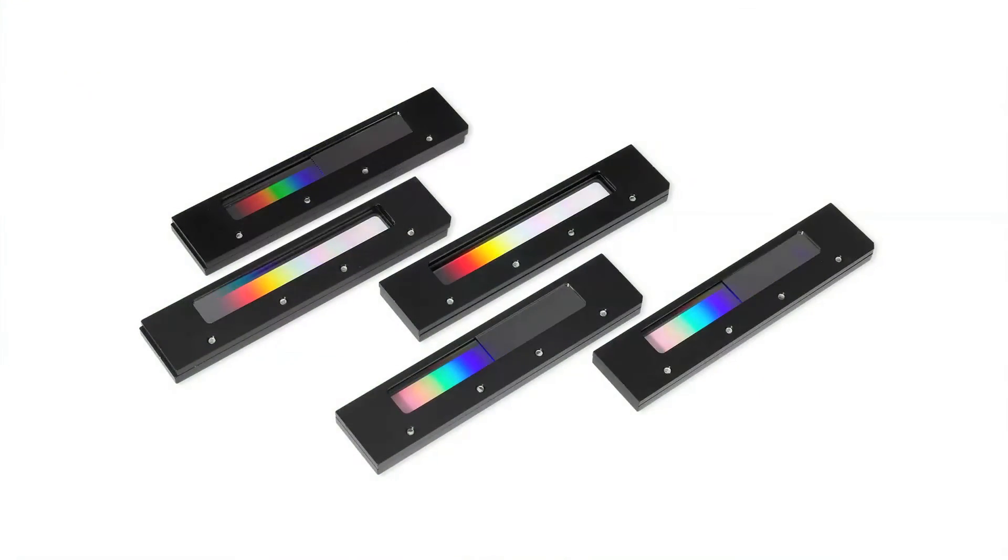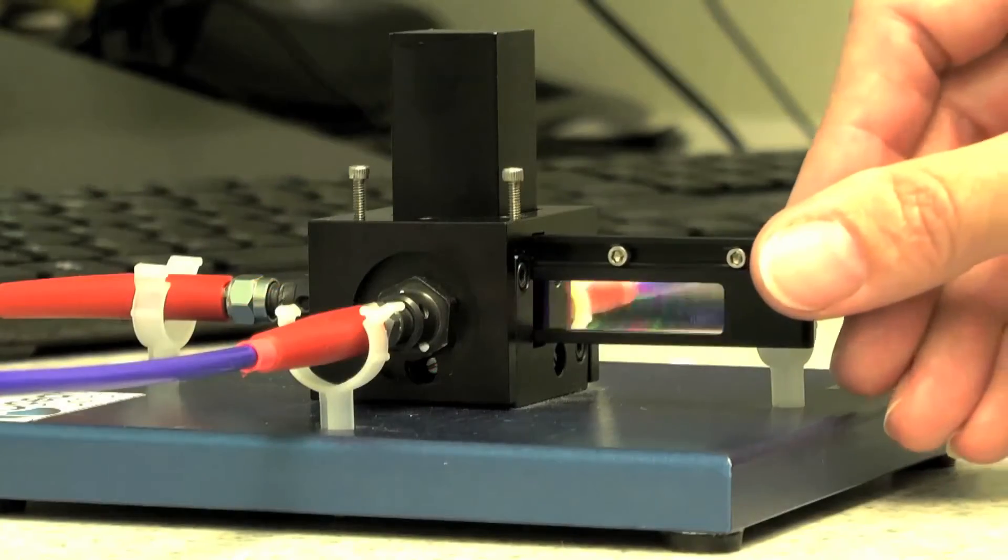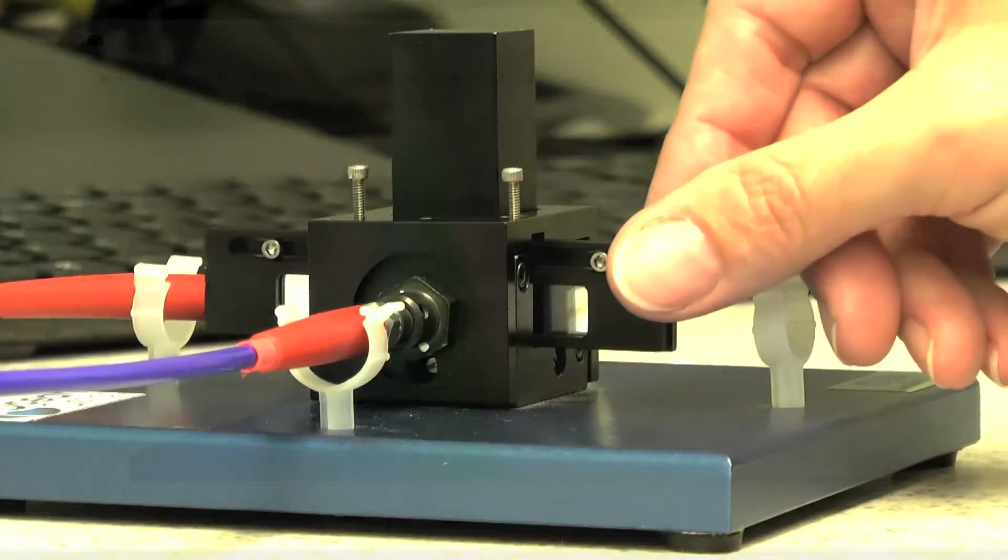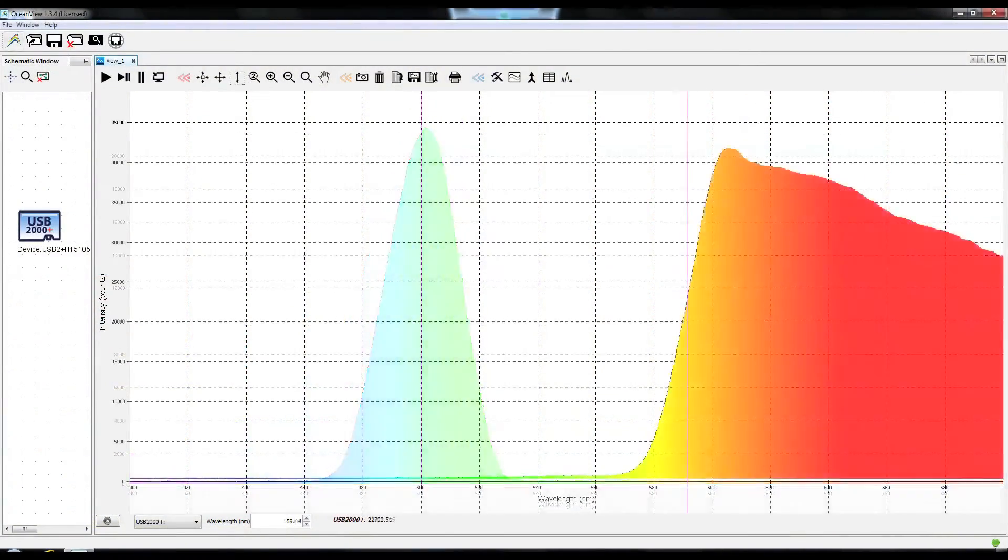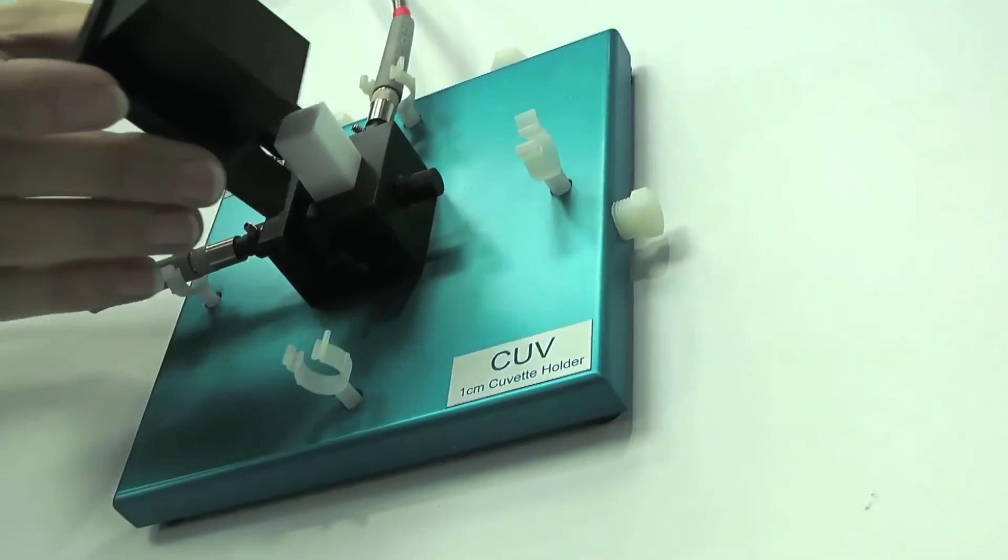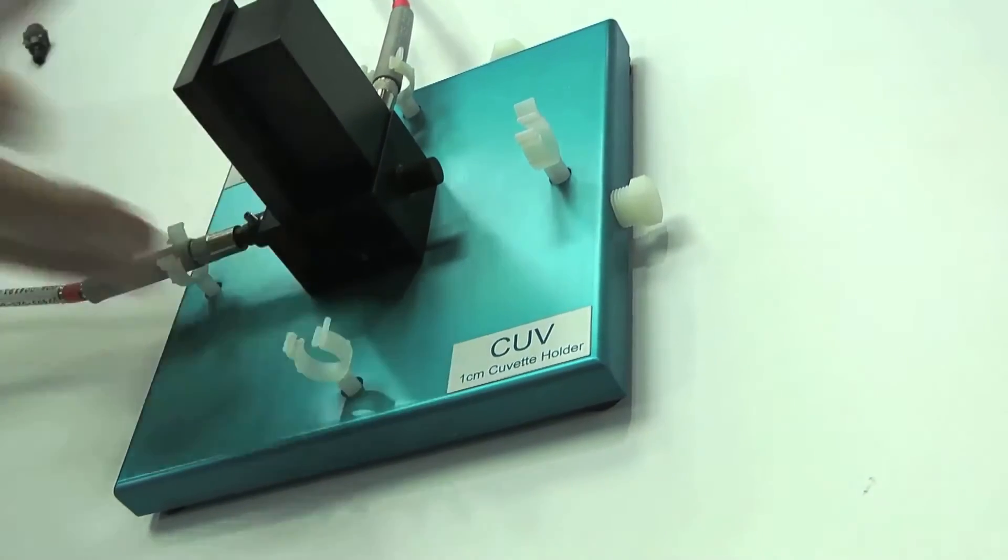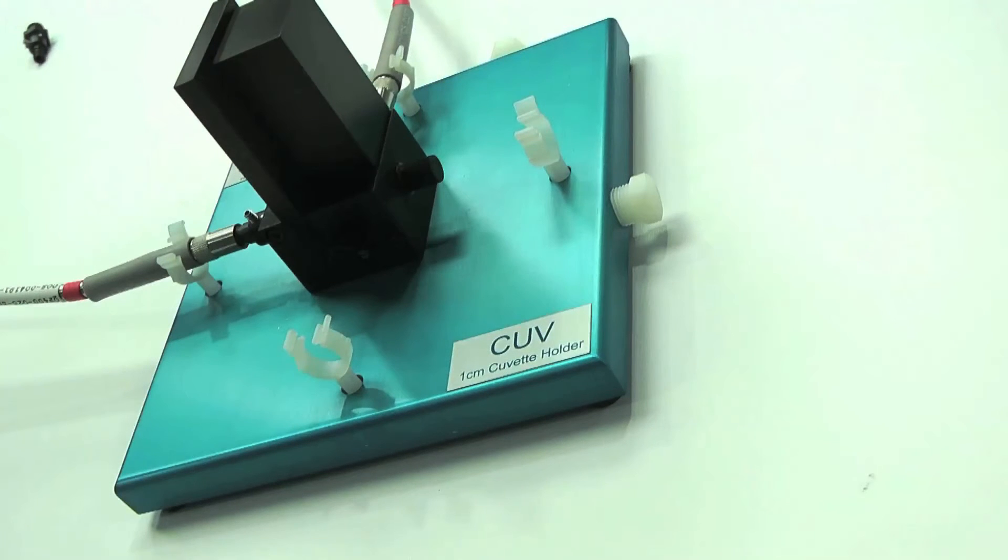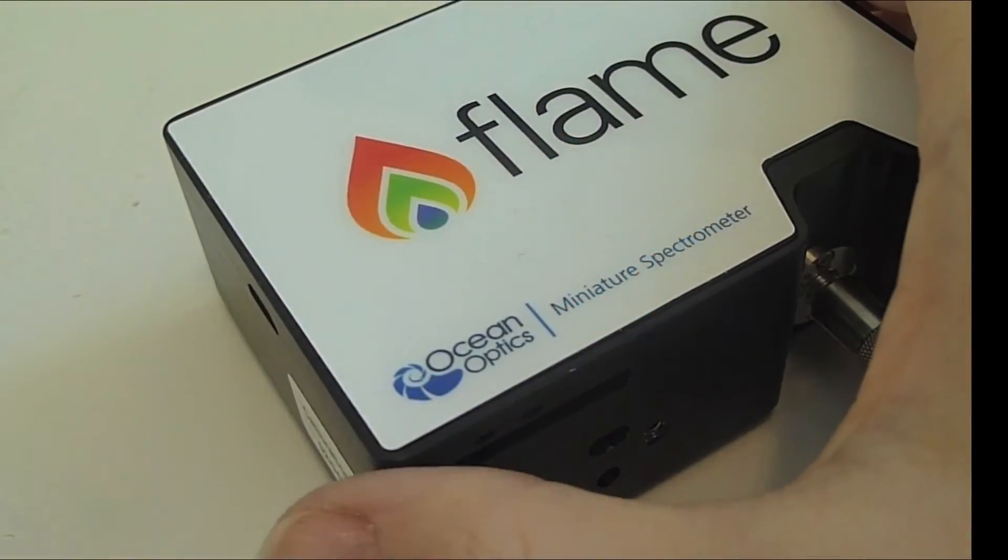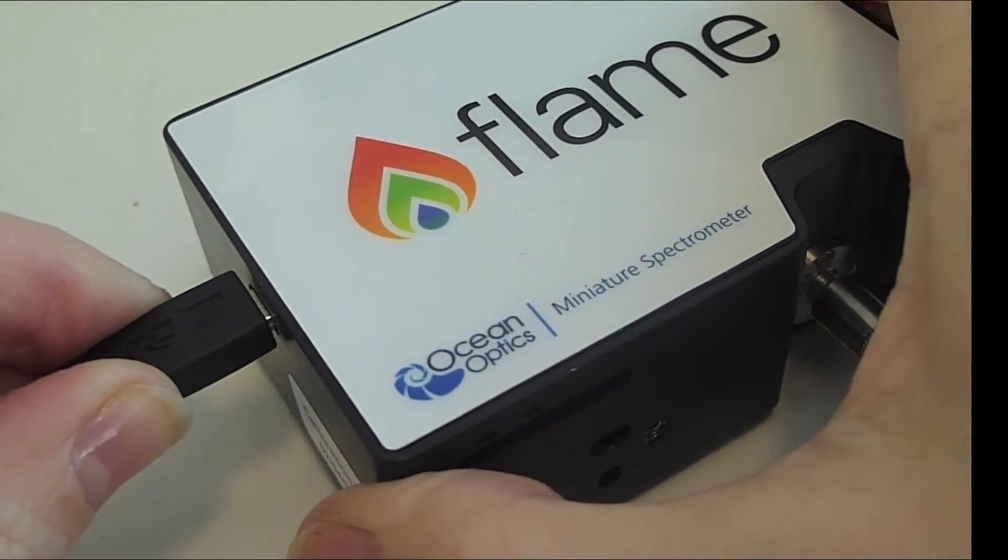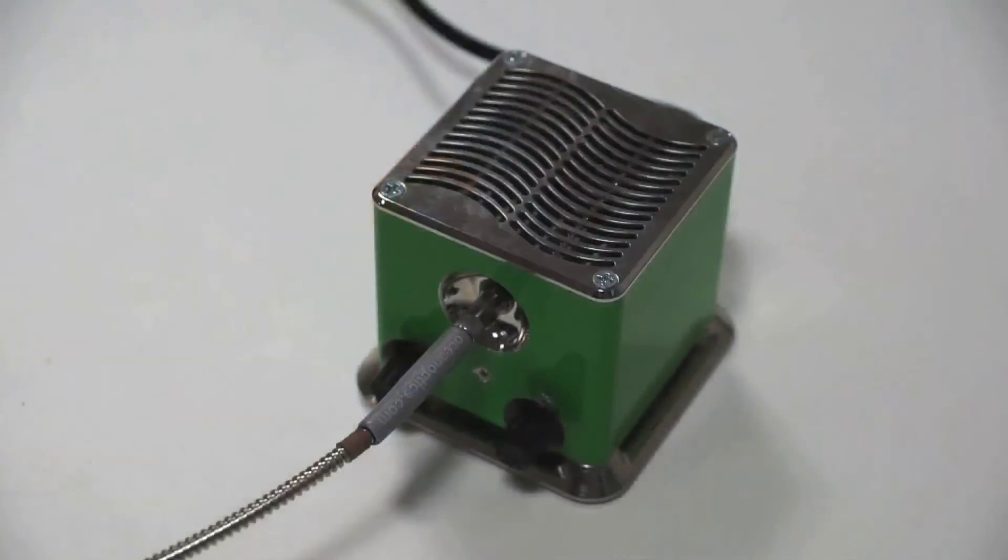To ensure no scattered excitation light is being measured as fluorescence, a narrow bandpass filter can be used to attenuate any extra light other than the fluorescent wavelength. The CUV cuvette holder also comes with a cuvette cover that can be placed over the sample to prevent any external light getting into the system. Finally, make sure your spectrometer is plugged into your computer with the micro USB cable and switch on your light source.